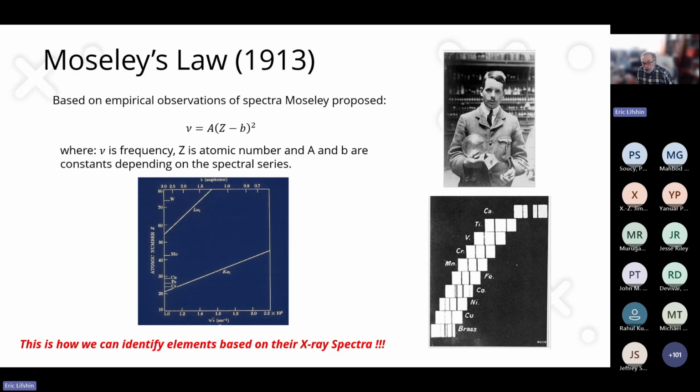And if you collected X-ray spectra, as shown in the lower right, you could see that each element provided a unique set of spectral lines. What was also interesting, if you look at the very bottom one, which is brass, is that you see the same lines as copper. We don't have a picture of zinc here, but the lines are separate. That is, an alloy doesn't show the line shifted. It shows a distinct spectra.